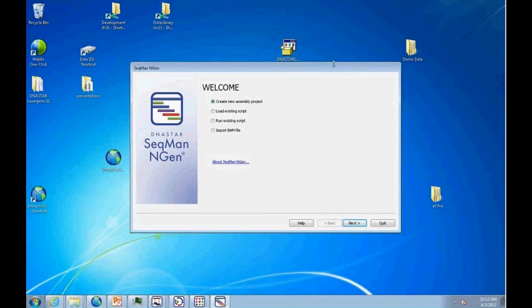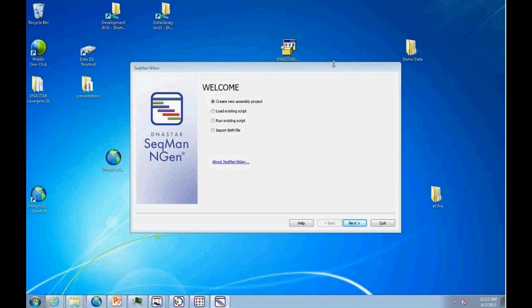Selecting de novo, we name the project, pick an output folder, and choose the save format. The preferred format is SeekMan format, which is fully editable — all aligned reads and consensus are editable. There's also ACE file format, though it's fading and inefficient with larger datasets, so it's not recommended in most instances. There's also a de novo BAM format developed by DNA Star that allows larger de novo assemblies without editing capability, supporting projects with more than 10 million reads.